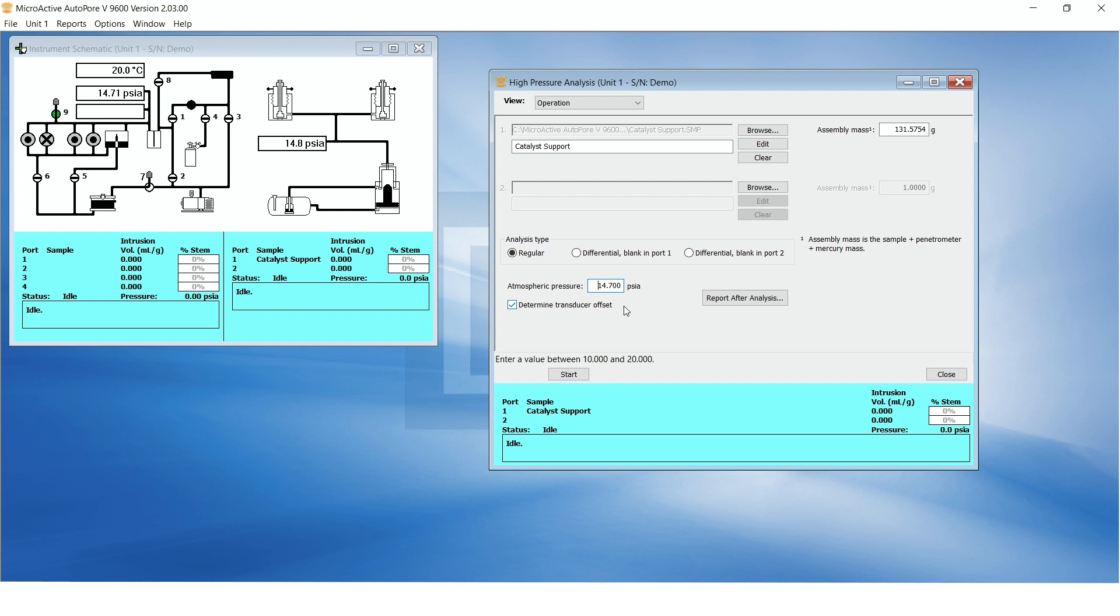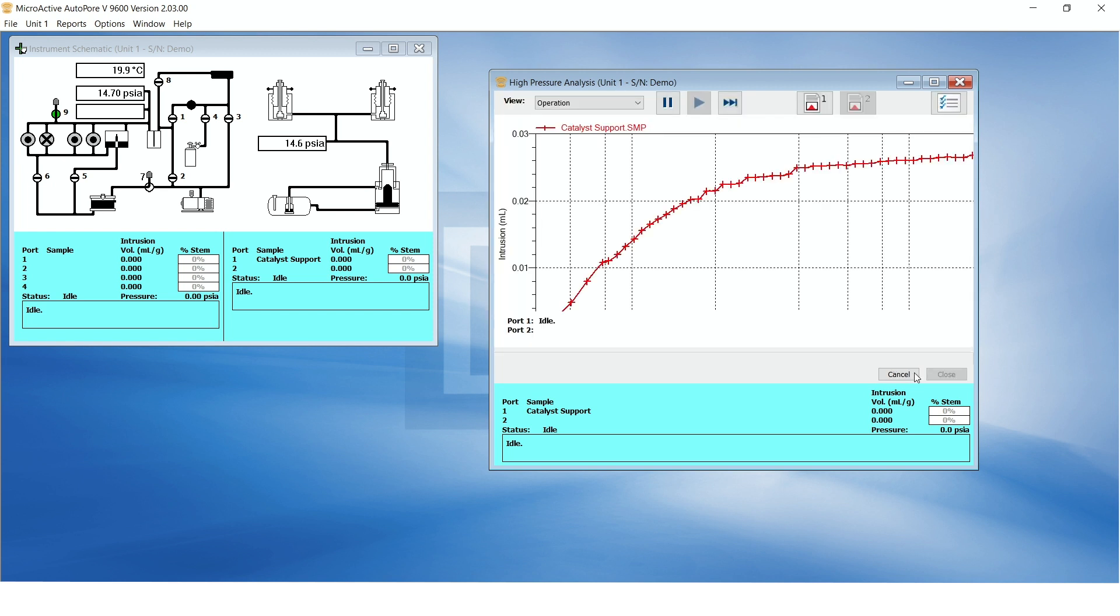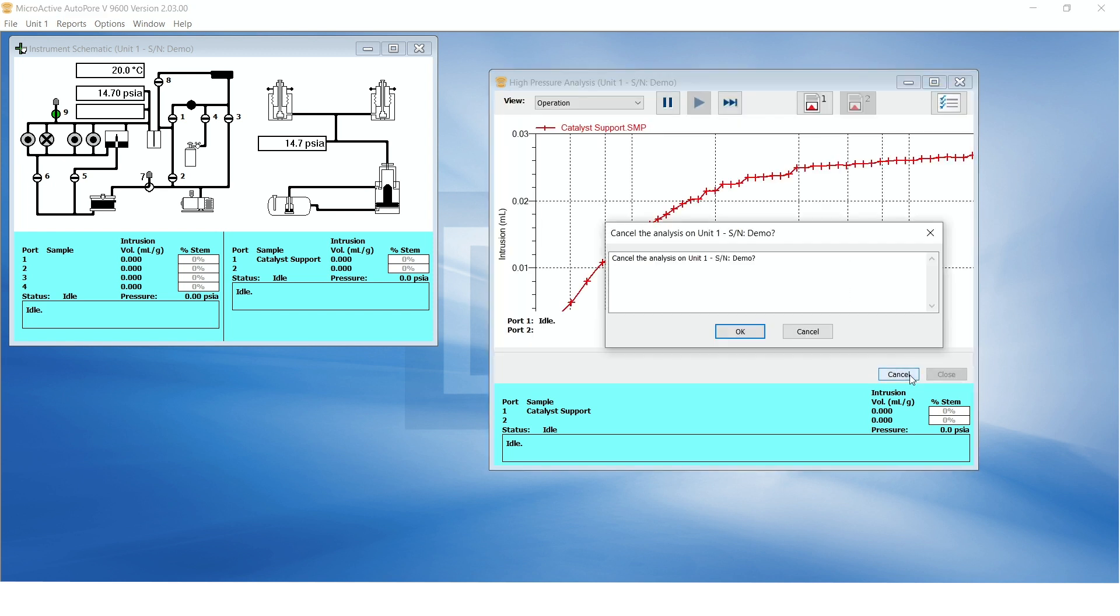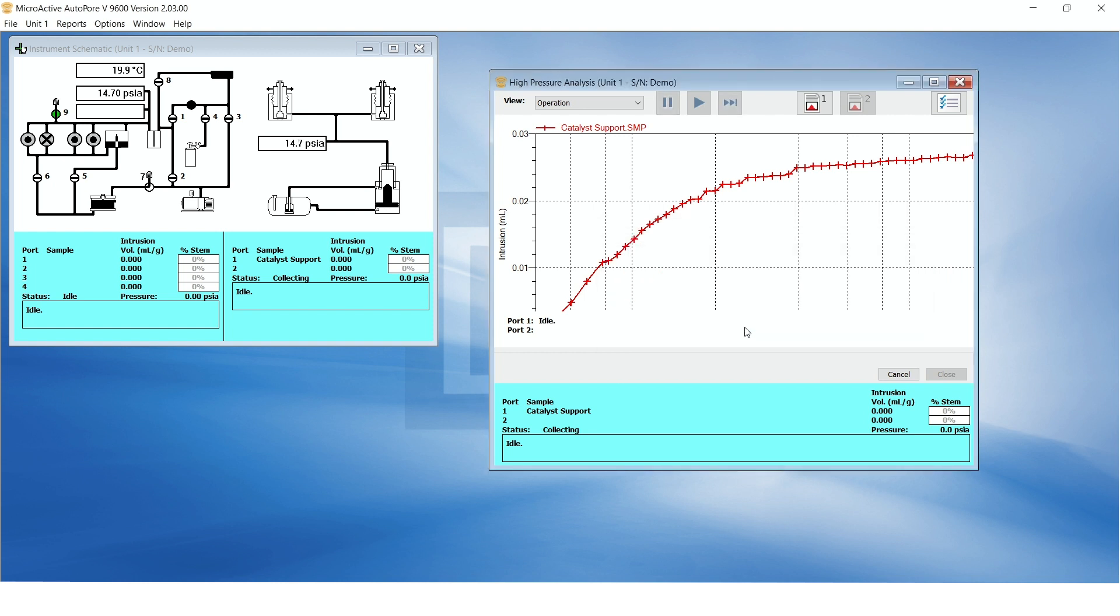Make sure that the determined transducer offset box is checked and enter the stable value for atmospheric pressure. Now click on start to resume the analysis of our alumina catalyst support sample. At an appropriate time, the software will instruct you to close the vent valves. Do so and click on OK to continue.